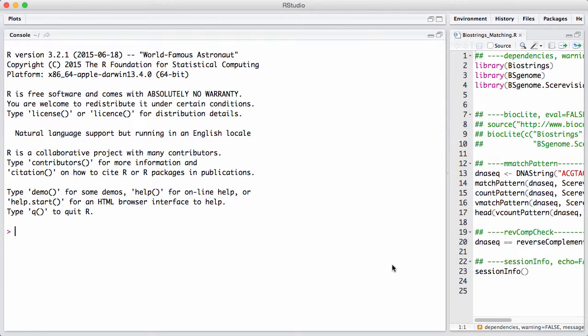In this session, I will introduce the matching functionality we have in BioString for finding subsequences in other sequences. This is something that's being used a lot nowadays. It's exactly what all the short read aligners do, such as Bowtie or Mac.